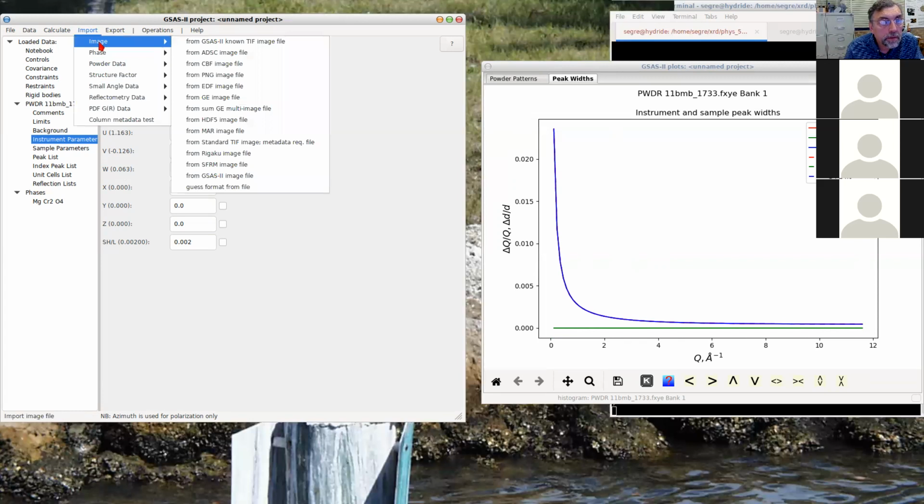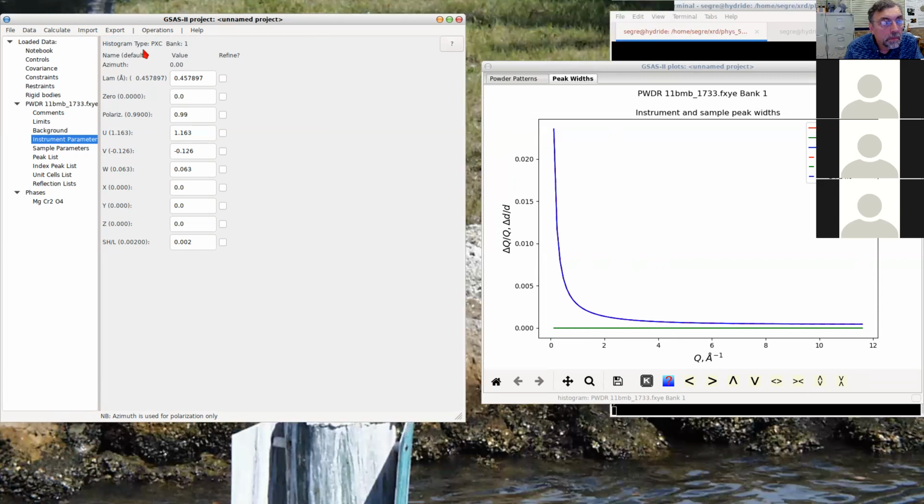Oh, maybe not. Let's see. I'm going to see if I can run it like this, but often it's better to use the actual parameter file. For some reason, it was smart enough and picked up whatever was in the header of the data file, and didn't ask me for a parameter file.